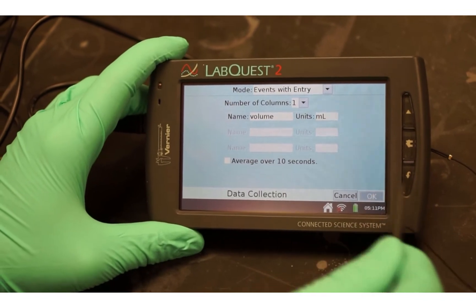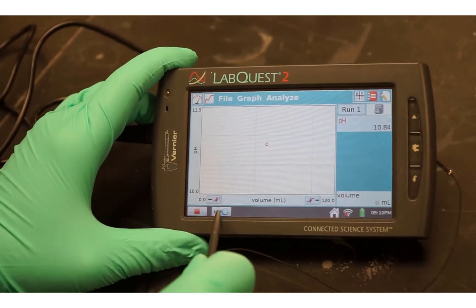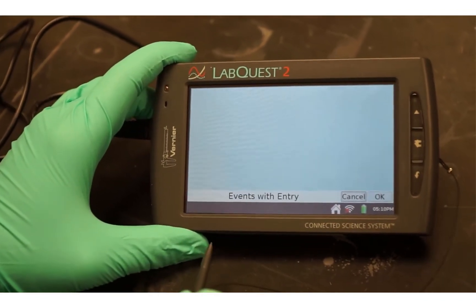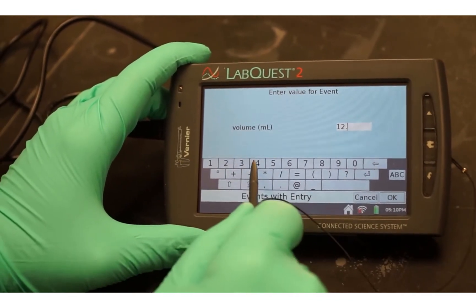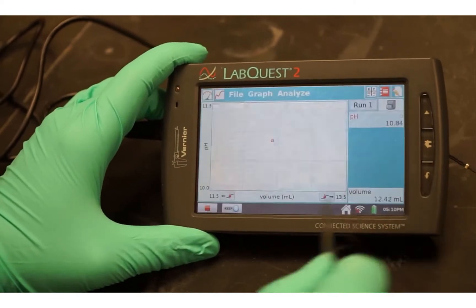Click the green Start arrow to start data collection. Before you add any HCl, tap Keep. Then read the burette and enter the exact burette reading in milliliters. Then select OK to store this data pair.